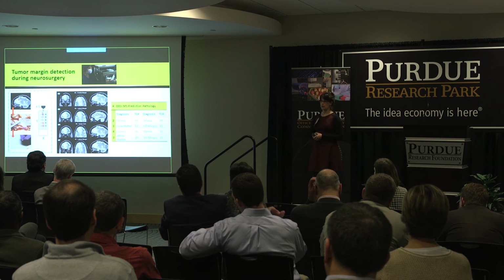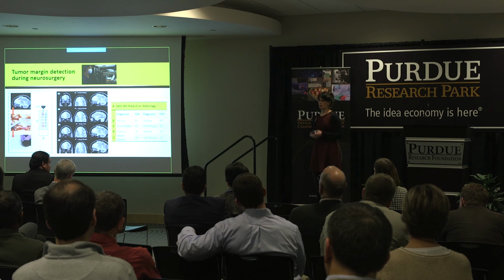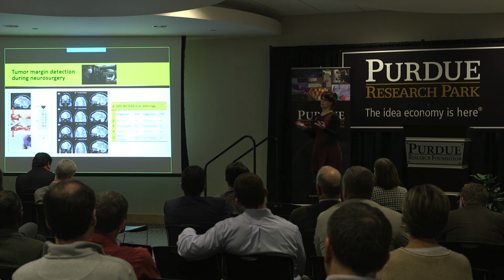With DESI instead, we can bring the instrument inside the OR, run analysis on tissue smears in about 2 minutes, and provide quasi-real-time feedback to the surgeon on the presence of tumor and the infiltration within the tissue.